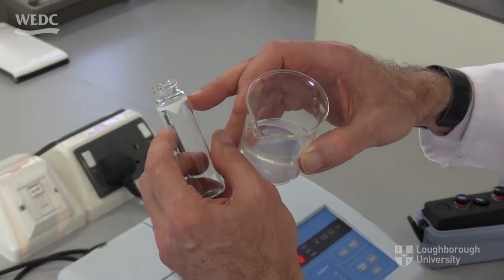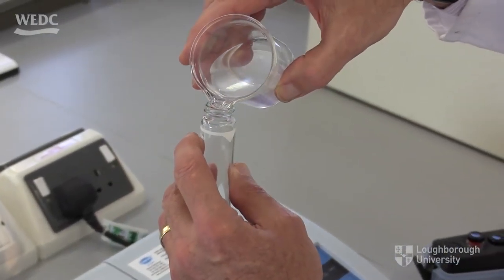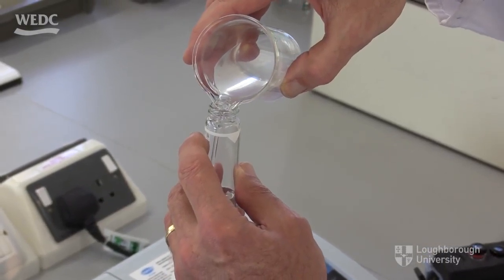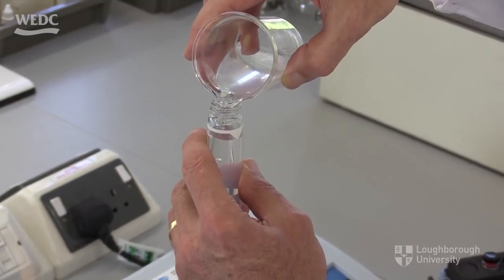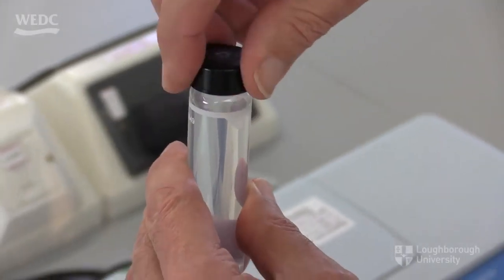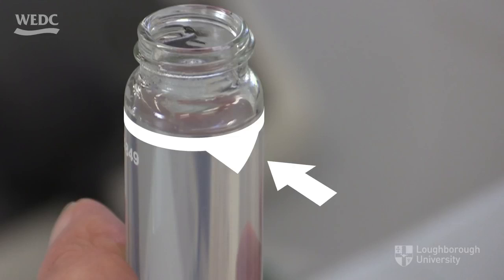Here you take a sample of the water to be tested, placed into a tube designed to fit snugly into the machine. Fill the tube with the turbid water up to the white line near the top of the tube and screw the cap onto the top of the tube. There is a small white triangle on one side of the white line. This triangle should point towards you when the tube is inserted in the turbidity meter.